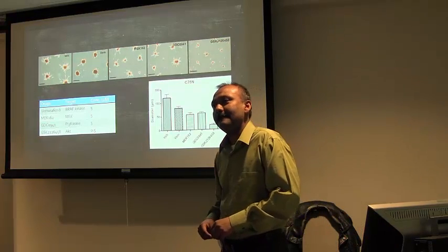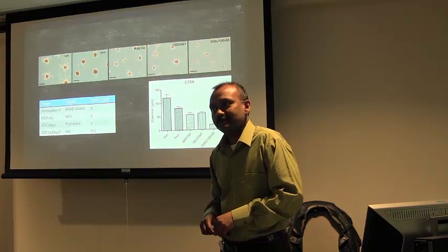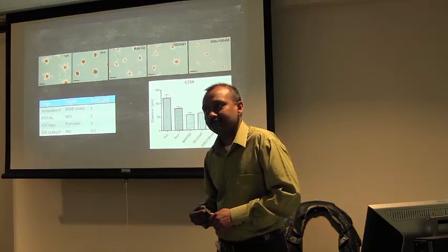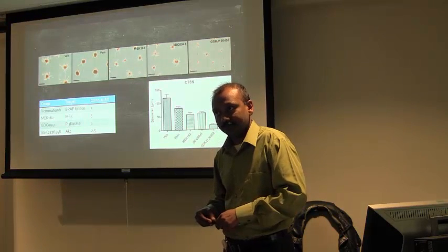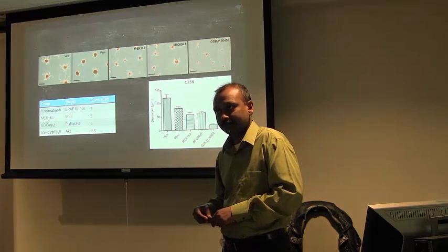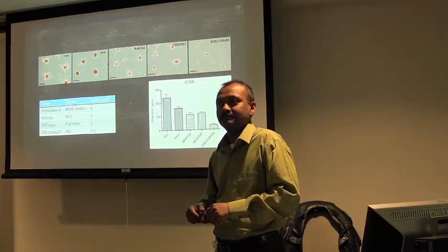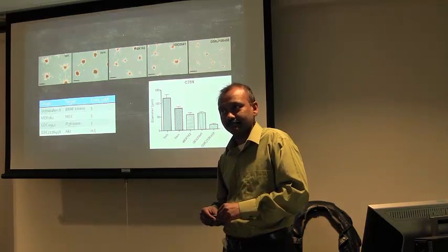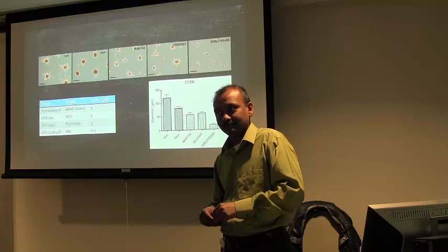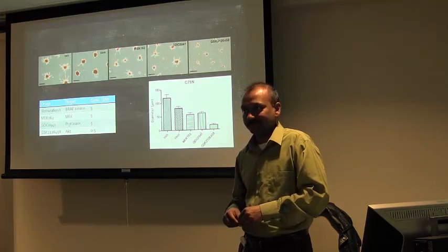As I understand, your real goal is to characterize the TICs, but what if your goal was to really recapitulate the behavior of the tumor in vivo? Would there be benefit to not selecting out all those other cell types, but maybe formulating the media or your modeling matrix so you could regrow the 3D structure with the different cell populations that you might have originally had?